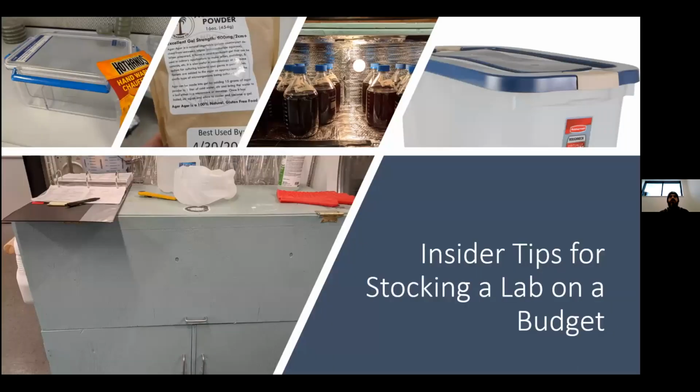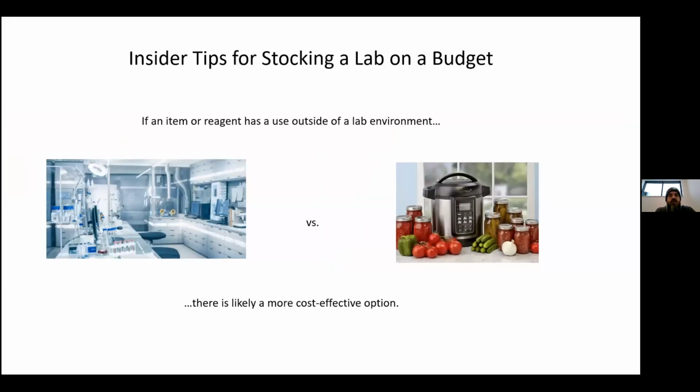Okay, so I'm going to again share some of the tips that we've accumulated over the years for doing a quality program cheaper. You don't have to buy it from science suppliers, and you can do a lot of things probably cheaper than you might imagine. As I'd alluded to before, if an item or reagent has a use outside of a lab environment, there is likely a more cost-effective option out there. Lab suppliers like to charge a lot for their stuff, and there are alternatives out there.